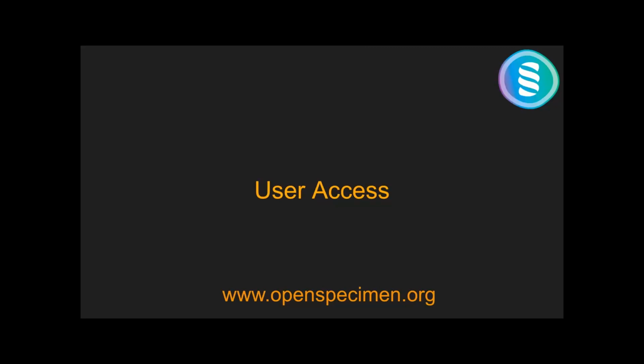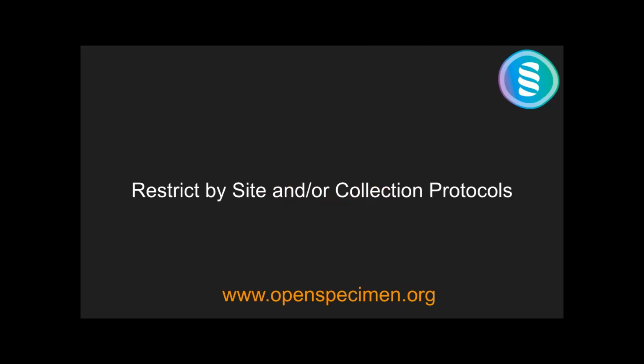Every container belongs to a parent site, and as long as the parent site is associated with the user as well as with the collection protocol, only then will the container be visible to a specific user. You can restrict it by site, by collection protocols, and also by specimen types.